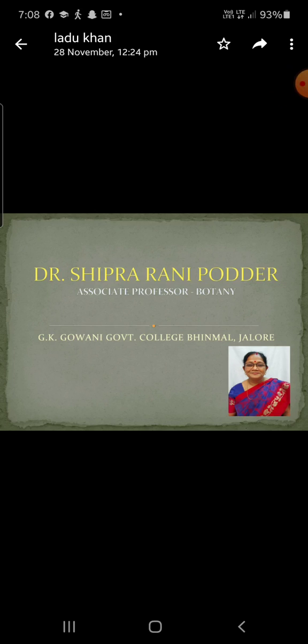First, part A is the rachis. This is the transverse section of the rachis. It is circular in outline. It has two rows of leaflets inserted on the adaxial side. The rachis is differentiated into epidermis, hypodermis, ground tissue, and vascular tissue.